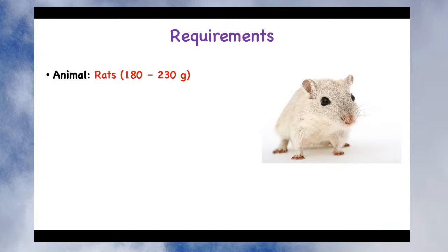It should not be very wide. It should not happen that you select an animal of 100 gram and a second animal of 200 gram. So there should be a proper range, and within that range you need to select the animals to conduct this study.